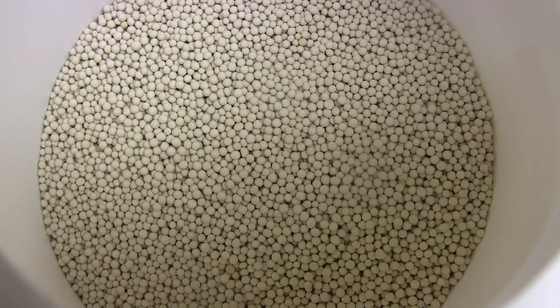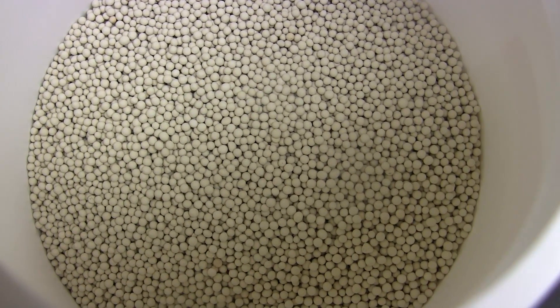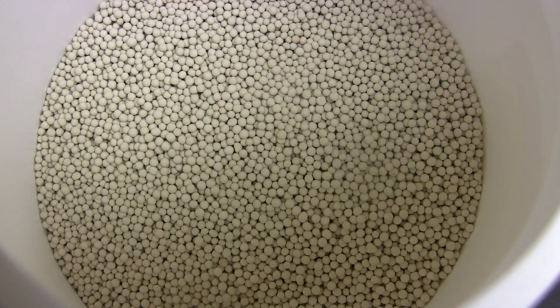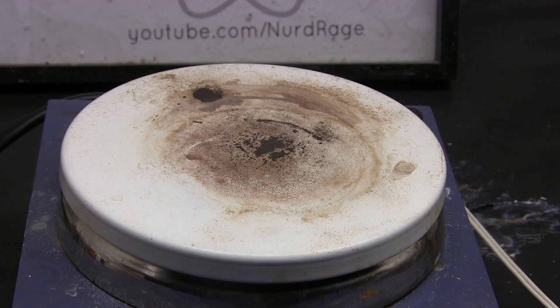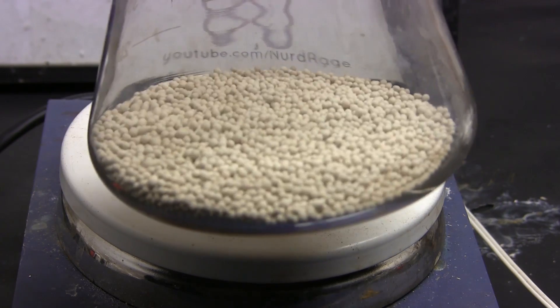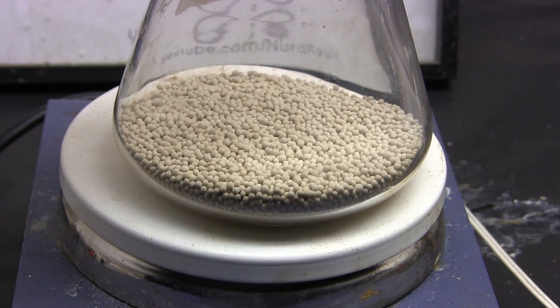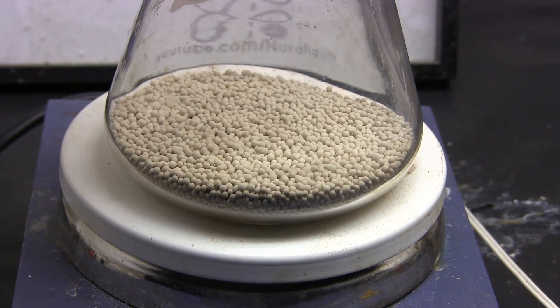Before we start we need to dry the molecular sieves themselves first. They've been sitting in air since they were made in the factory and have absorbed water. Get an amount corresponding to about 10–20% by weight of the solvent you want to dry. Now we need to bake them — put them on a heat source and raise the temperature to whatever the manufacturer specifies as the regeneration temperature.